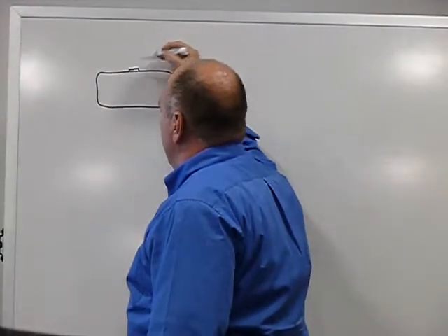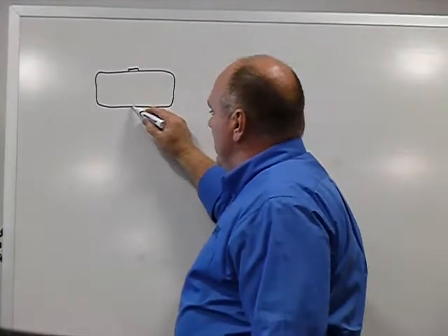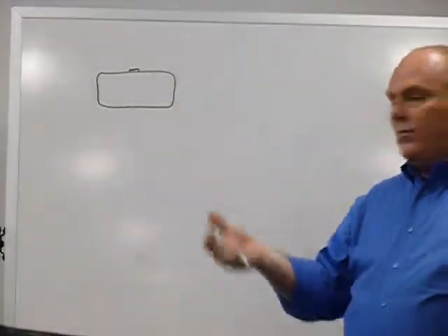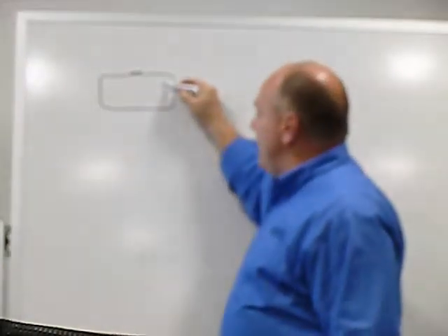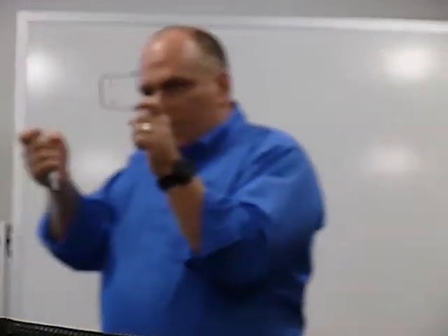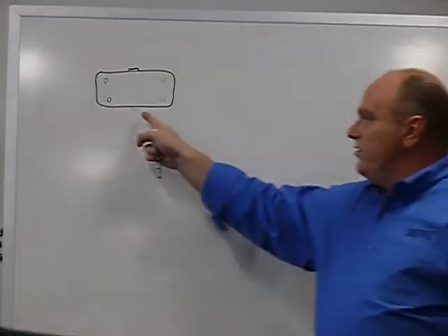Looking down at it, there's actually a clip in the back, a little plate back here, that holds the bath in. And then there's one in the front also that actually can be twisted down, top and bottom. So that needs to be twisted out of the way in order to pull the bath out whenever you do. And there's feet on the bottom of the bath, 4 locations. We have the same setup on that one back there also. Those things need to be twisted downward, and it allows the acrylic bath to be lowered a little bit, and it can be pulled out when this is slid up out of the way.